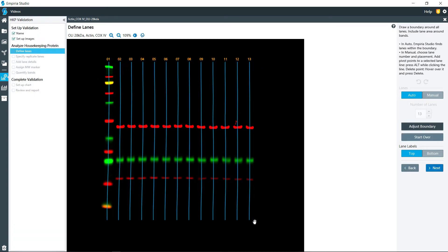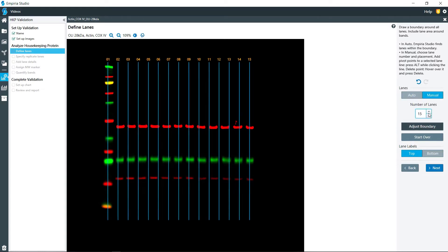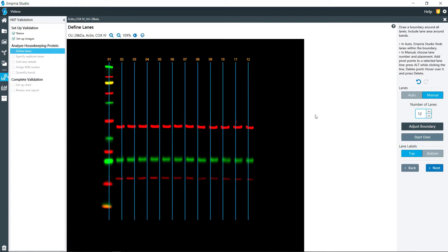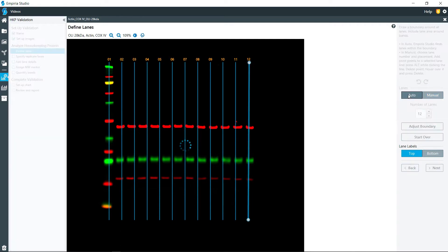It does attempt to do automatic band finding. If you find that the auto lane finding does not work for you, go ahead and click on manual right here. Then you can adjust the boundary, the number of lanes, the position of the lanes, and you can even angle the lanes a little bit if you need to as well. But I'm going to go ahead and switch back to auto.